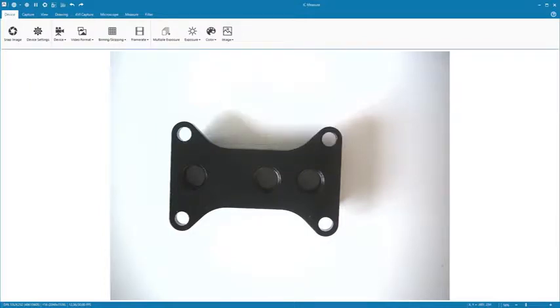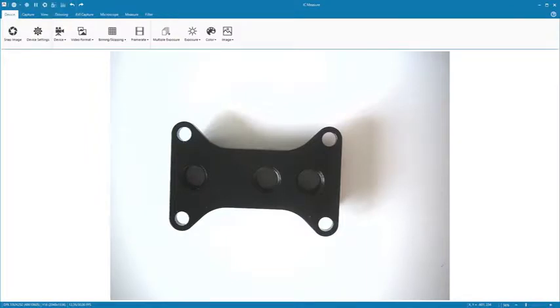Create an image at any time by clicking Snap Image. You can also find this function in the topmost menu bar.